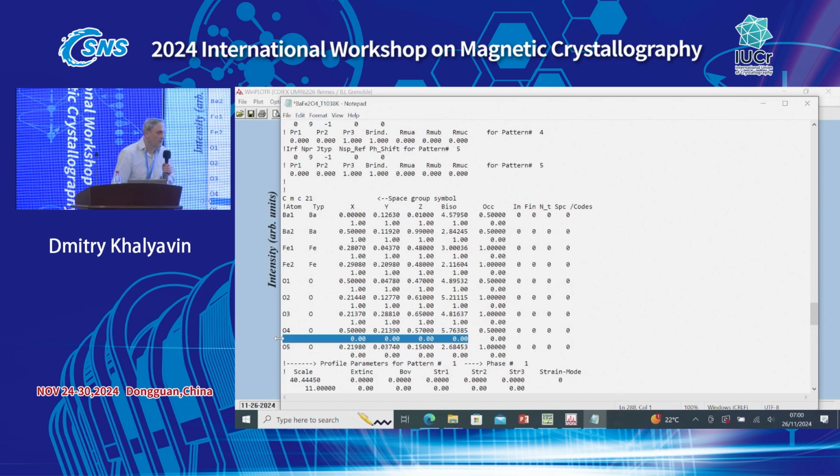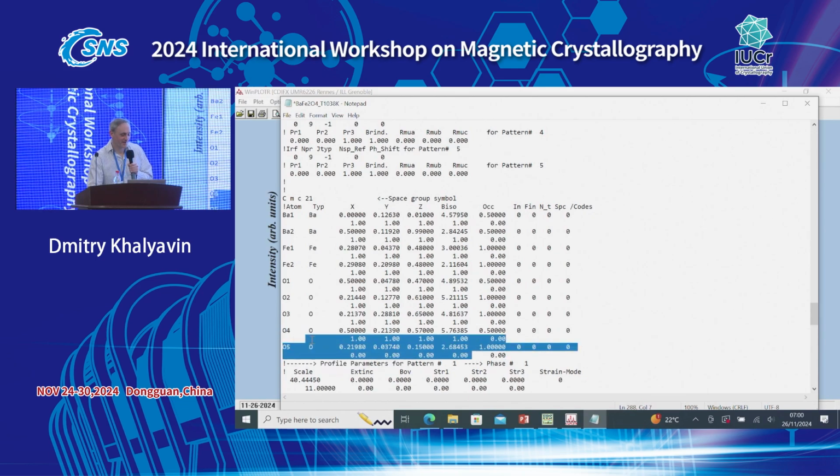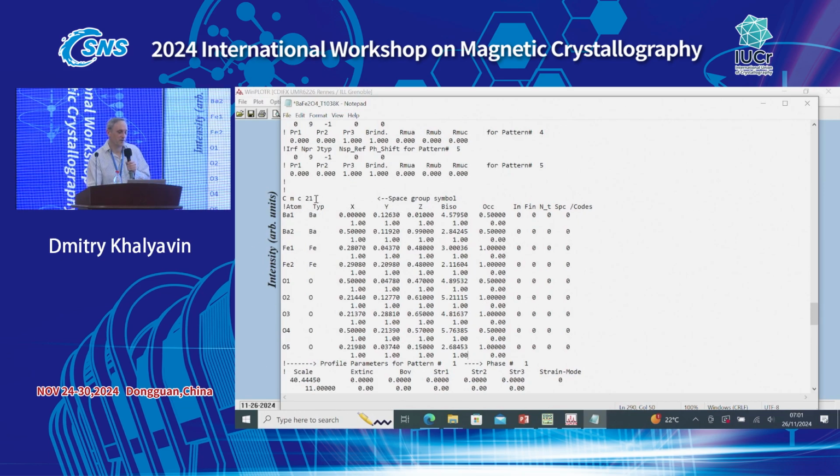Yeah. You have a non-centrosymmetric space group, and the origin is floating. We need to fix, yes. We need at least one Z coordinate. It's correct, absolutely correct. Right. So do you see, look at our space group. Yes, because our space group is non-centrosymmetric. So the C-axis is a twofold axis, so we can have a global shift and we can have a global instability in our refinement if we let all Z coordinates refine. So we need to fix something.